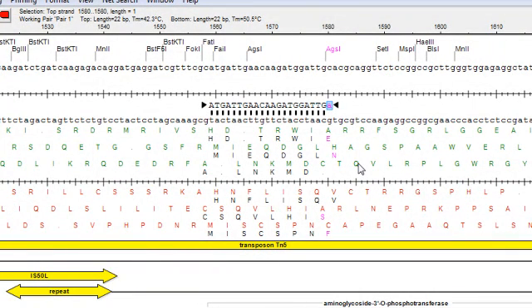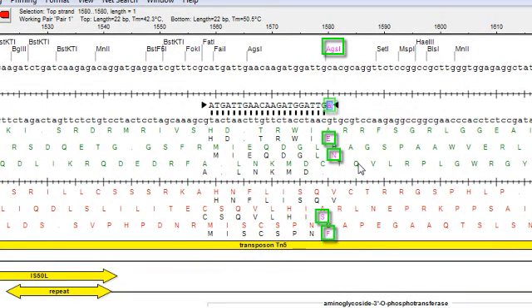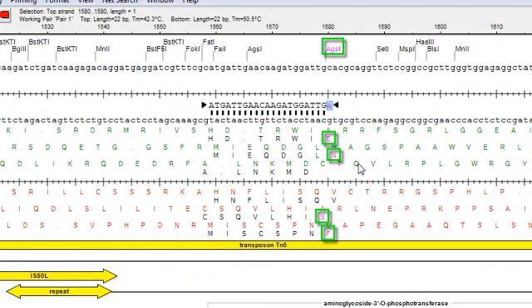And when you do that, the edited nucleotide, as well as the resulting changes in translation and any restriction sites that were introduced by the change, are all shown in magenta.